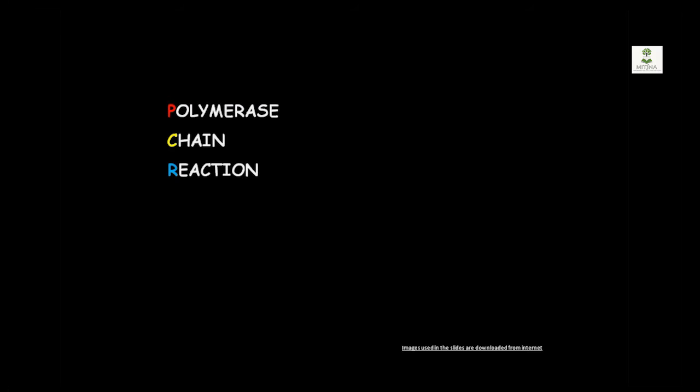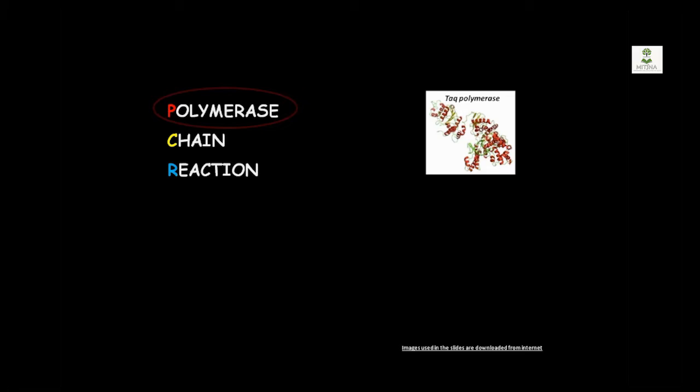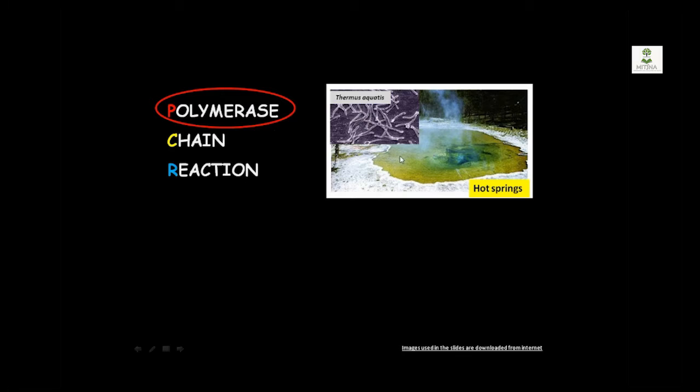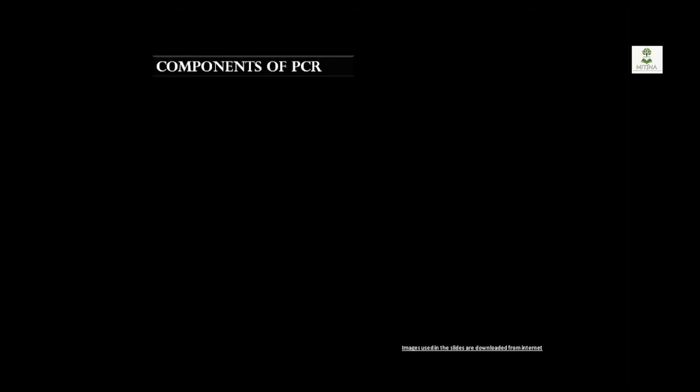So why the name polymerase chain reaction? The word polymerase is used since this technique involves an enzyme known as the polymerase enzyme. The most common polymerase enzyme that we use all over the world is the Taq polymerase, which is an enzyme isolated from the bacteria known as Thermus aquaticus, which is naturally found in hot springs. And this technique involves a series of continuous reactions inside the tube, hence the name polymerase chain reaction.